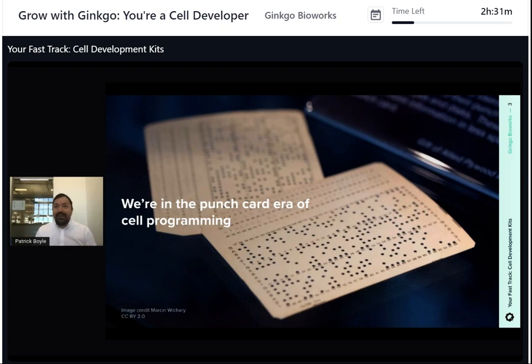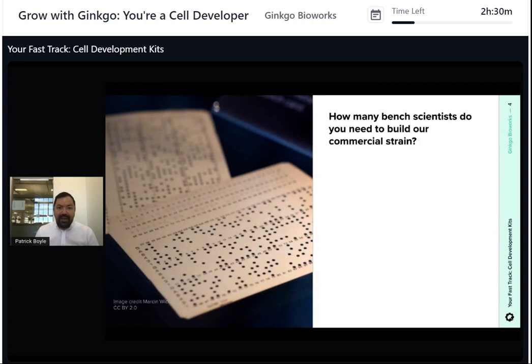When I did my PhD, more than a decade ago now, I designed and synthesized 6 different genes for my entire PhD project, and that was a lot of work. I did a lot of cloning while I was doing that, and effectively, the majority of my time was spent smashing small pieces of DNA together, not actually doing my thesis research. And this is how it's done in most places today.